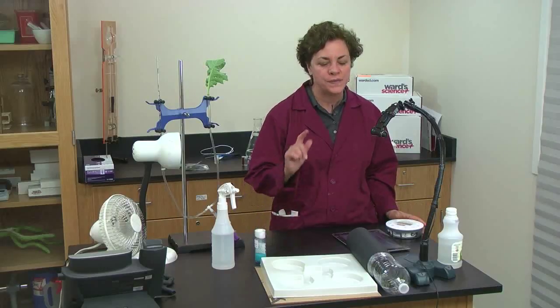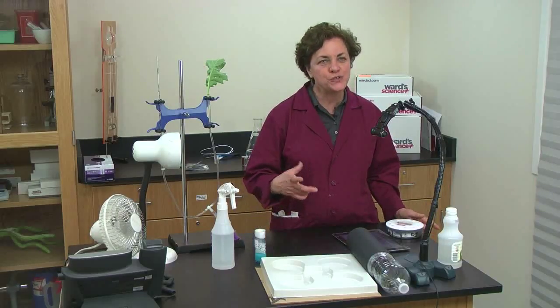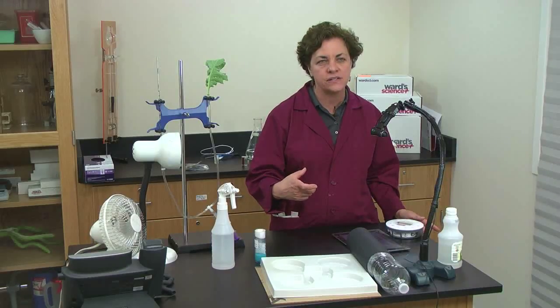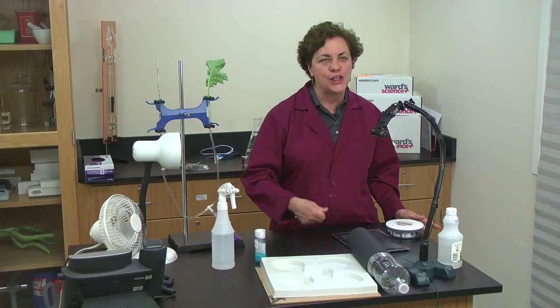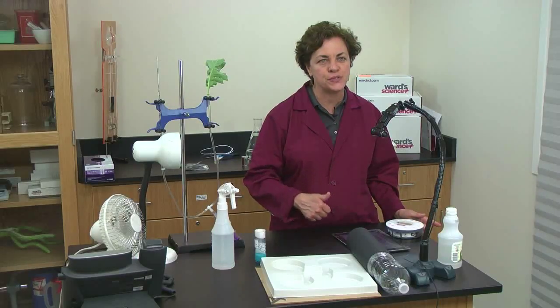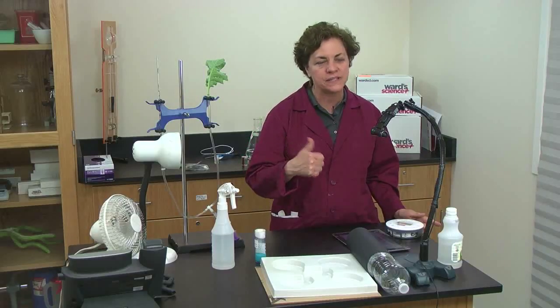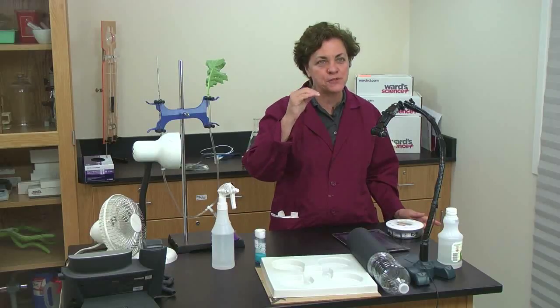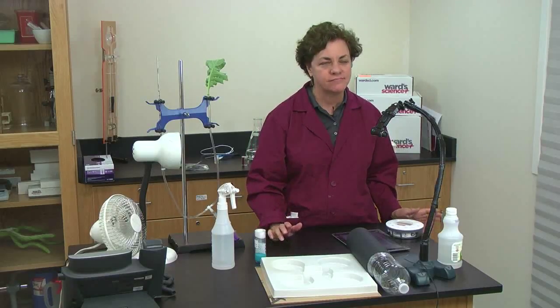I think probably, because they're both going to be food sources for those animals. But I also need to add, if you have them do the larval forms, make sure that they don't take third instar. If they're starting to pupate, they're not going to go across the agar from one side to the other. What they're going to do is go up the agar and try to get out, because part of the pupation is to get high up so they can hang as cocoons. So just as a side point there.